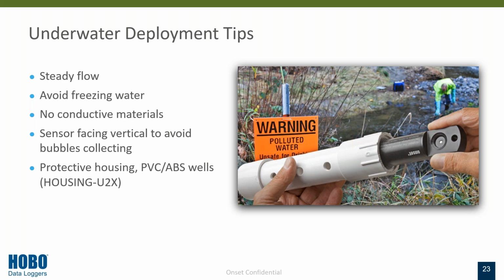In addition to that, we want to avoid any conductive materials. And when deploying the logger, you make sure that the logger is facing vertical, not horizontal, in order to avoid any bubbles from collecting. We do offer protective housing units if you are in an area that is pretty rocky or anything of that nature in order to protect it.